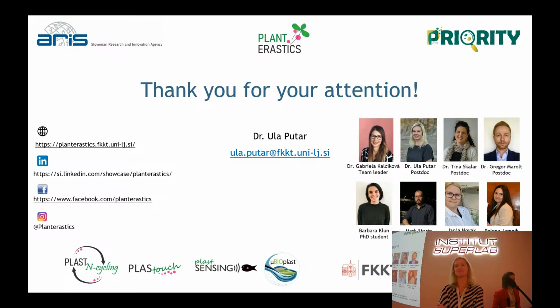Thank you for the nice presentation. Can you please clarify how do you treat the accumulation of microplastics? Is one size the highest one? You mean for the characterization? Yes. Usually to determine the size, this is the main issue, because if the particles are agglomerating, then you cannot really measure the right size.